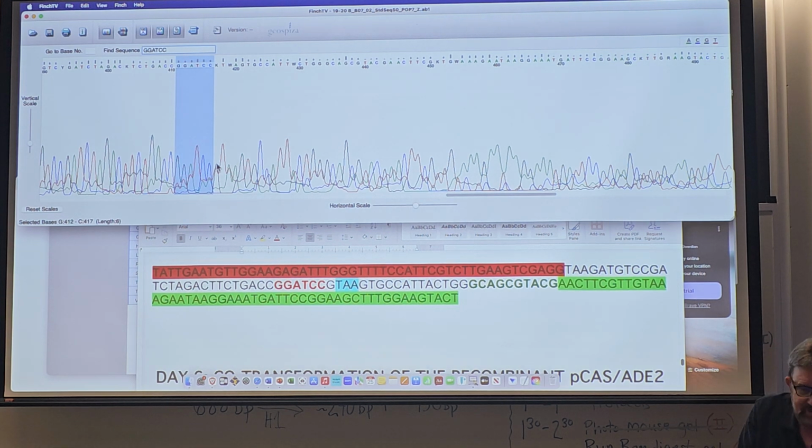Then the next 3 nucleotides ought to be TAA. Well, there's T, and now we have that same situation with the double peak, but the A is a little higher, right? And then the next one is clearly an A. So GTAA, and that's our stop codon. Now let's keep reading. This is supposed to be a G, right? Then a T. You watch up there, I'm watching down here. G, C, and then I'm going to call that CA, and then TT. So, I mean, we're clearly in the right spot. So this clearly is the sequence of our replacement editing fragment.